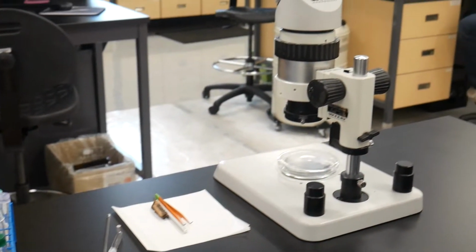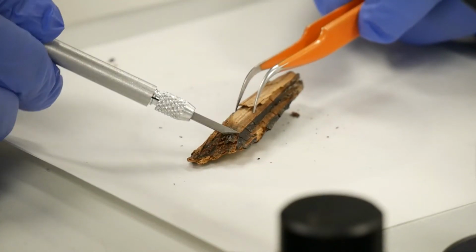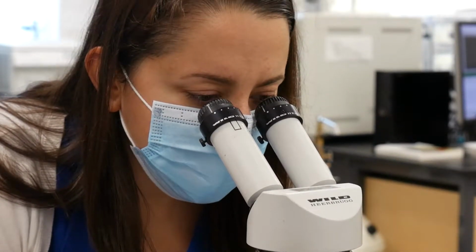So typically archaeologists will submit organic materials. The first stage once they come into the lab is we do some physical cleaning, pre-treatment. So we would scrape the exterior off of a wood sample, charcoal, try to remove any rootlets, and target just the material that we're interested in dating. Second, we might apply a chemical pretreatment, where for wood samples, an acid treatment would help remove any foreign materials that we don't want to analyze, so carbonates or mobile organics.